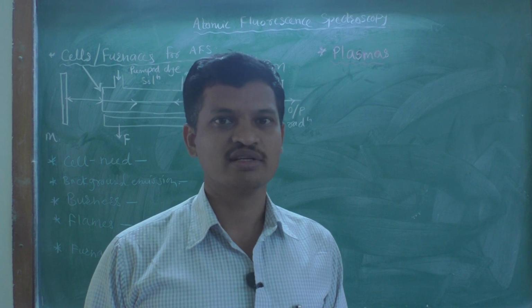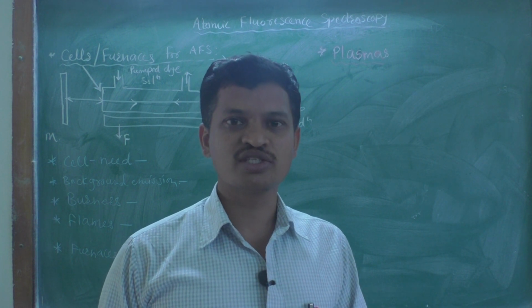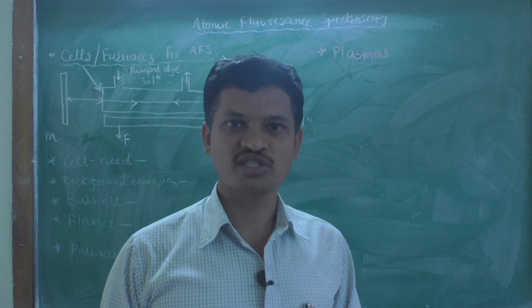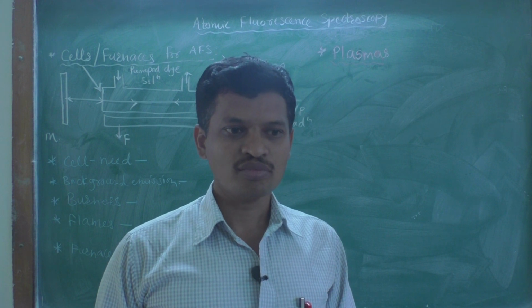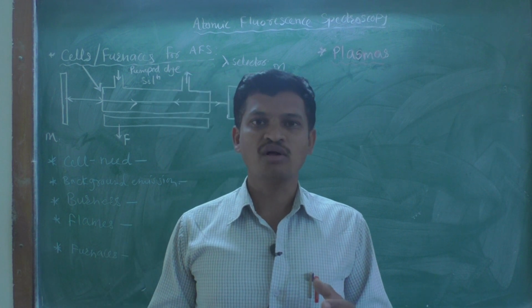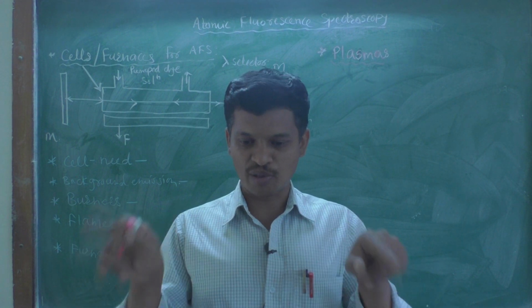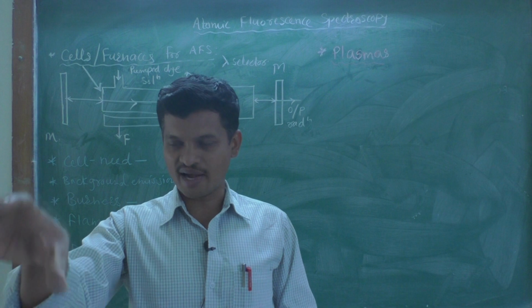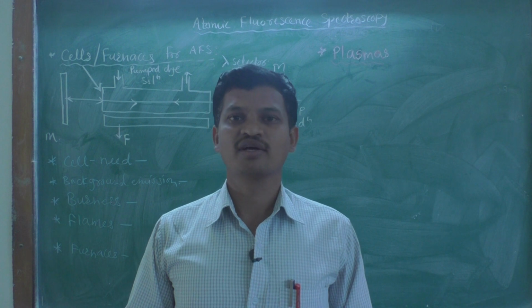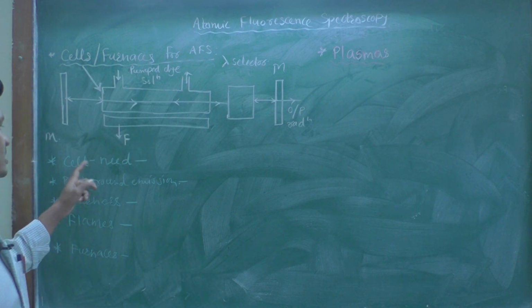Once the pulse or continuous source has been emitted, the atoms of our sample must be present within a particular path length to absorb that radiation and for the further processes occurring in AFS.